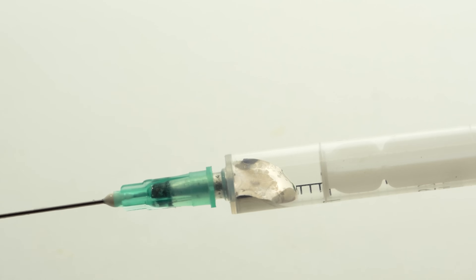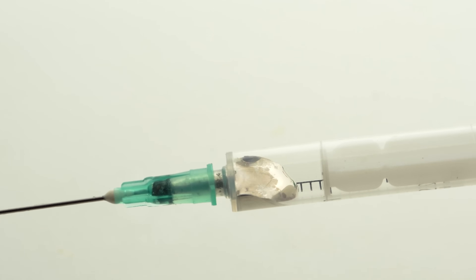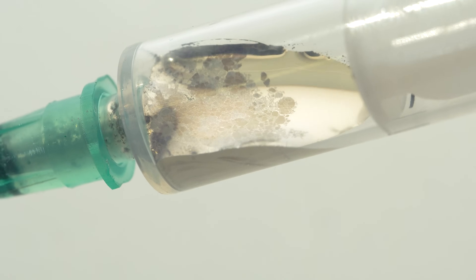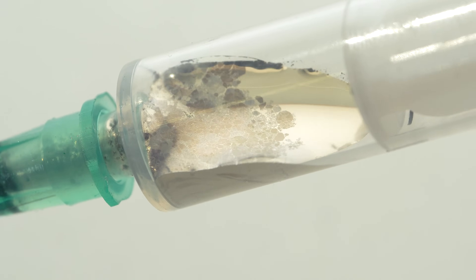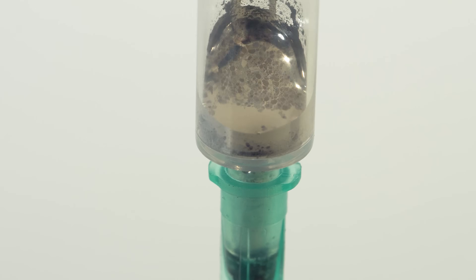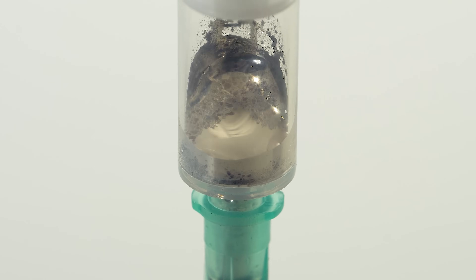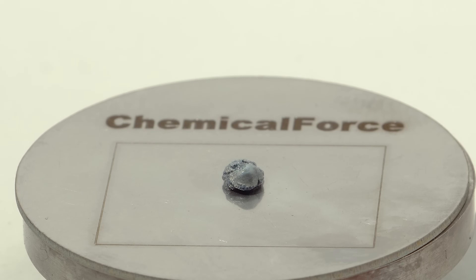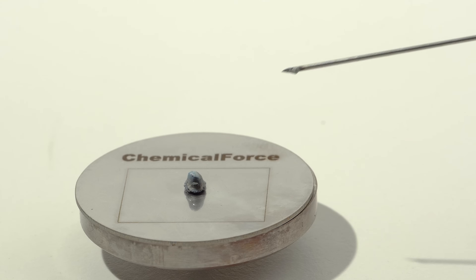This alloy is extremely active, and in the presence of even a small amount of oxygen, we can already see the formation of an oxide film. As soon as I try to squeeze it out of the syringe, it immediately becomes covered with oxide and turns into a solid mass. For this reason, the syringe gets clogged very often, and during the filming of this video, I had to change both needles and syringes many times.